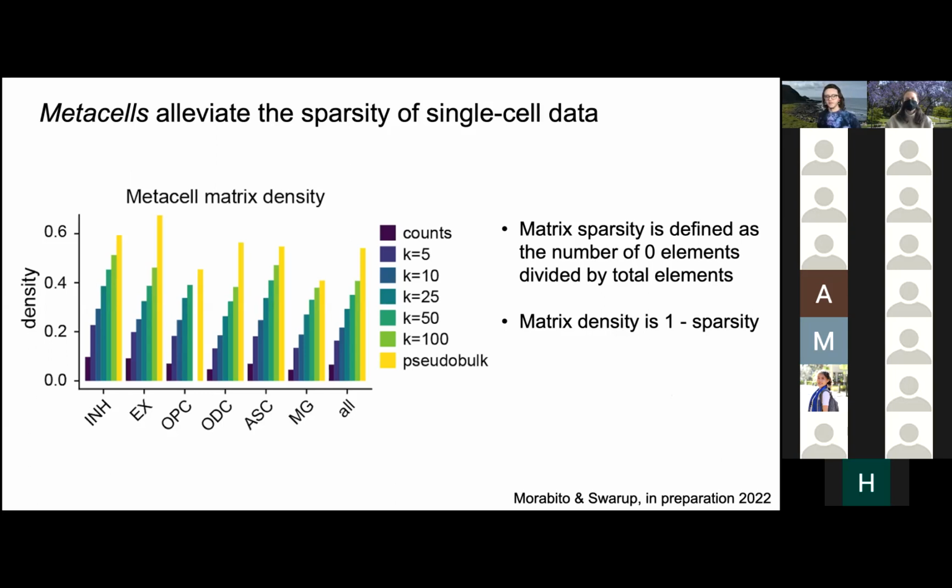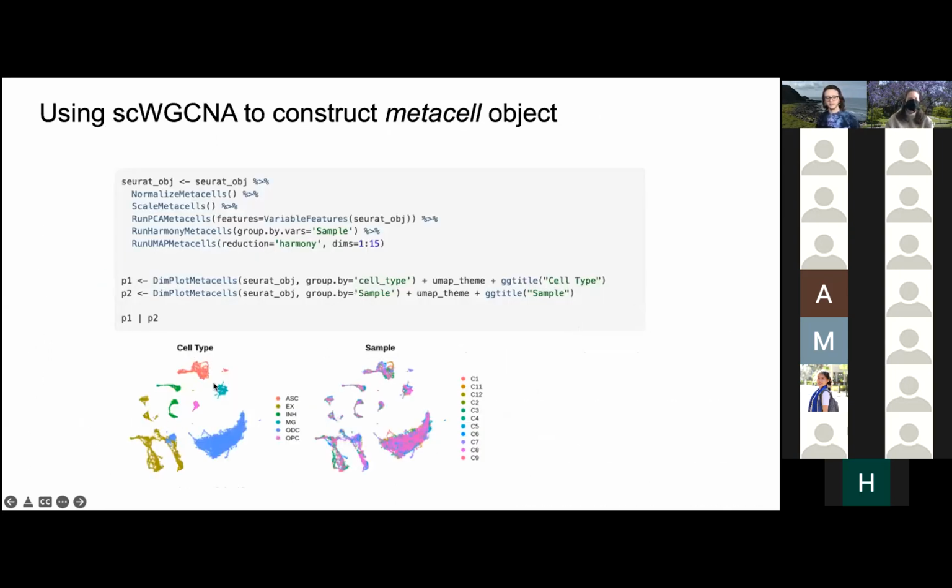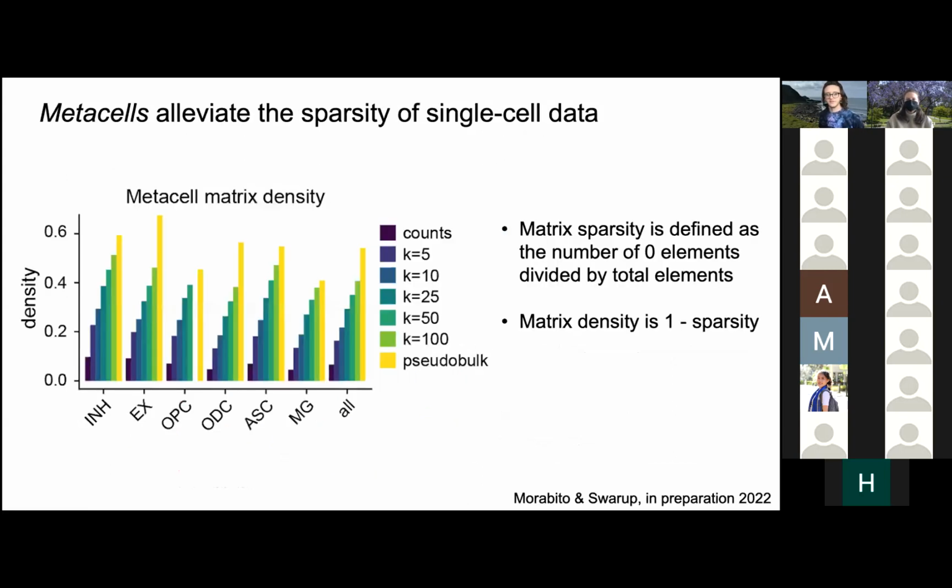So it actually depends more on, if you do it this way, like I did, where you split it by cell type and by sample, even if your data set is really large, each sample will probably still have a similar number of cells. So I guess you could just not split it by sample. Let's say you just split it by cell type and then control versus disease condition. In that case, you could increase the number of meta cells for sure. Okay, thank you.